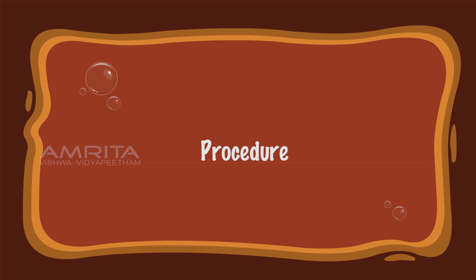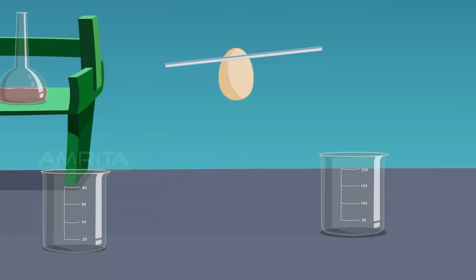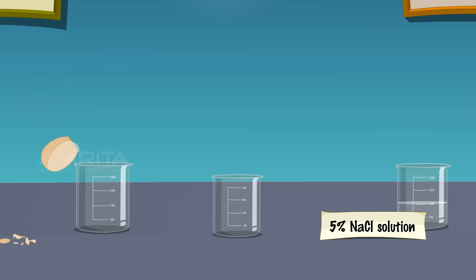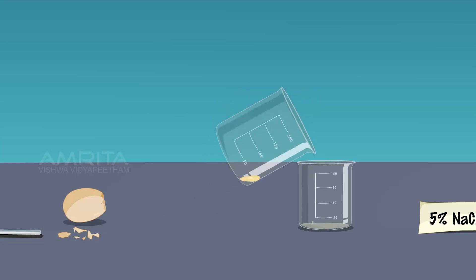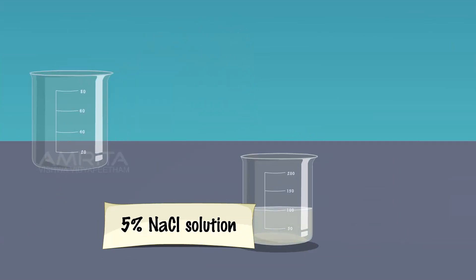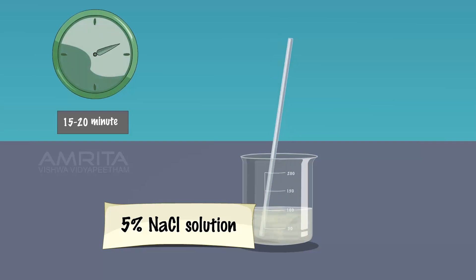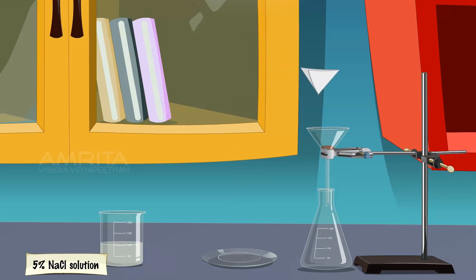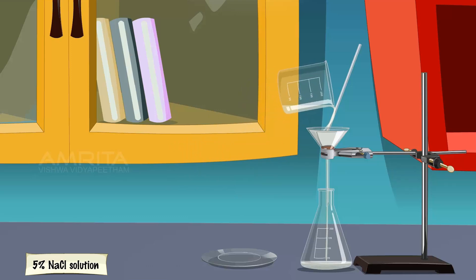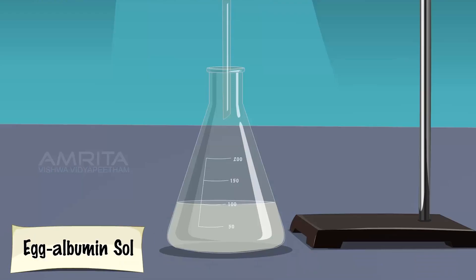Procedure: Take an egg. Break the outer shell of the egg by striking it with a glass rod. Collect the colorless liquid, egg albumin, along with the yellow yolk in a beaker. Decant the colorless liquid, egg albumin, into another beaker. Transfer the egg albumin into a beaker containing 5% sodium chloride solution and stir it constantly for about 15–20 minutes. Fix a filter paper in a funnel fixed to a stand and place a glass rod over the funnel. Filter the contents of the beaker and collect the filtrate in a conical flask.